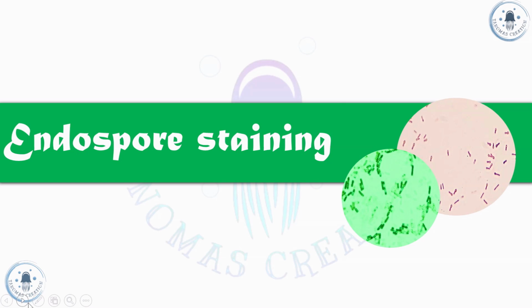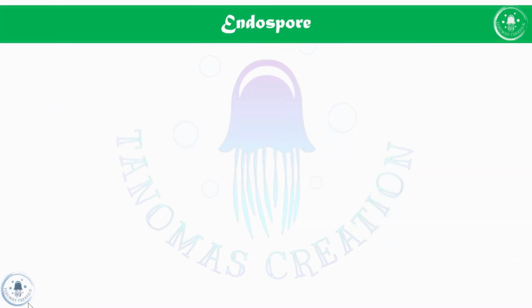Hello everyone. So today we are going to learn about endospore staining. It's a type of staining method, and we have learned about staining methods in our previous video. Before moving forward, we need to know what endospores actually are, so we'll have a brief discussion about it.